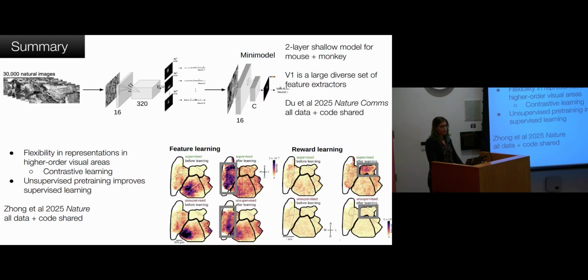Are you zoomed in as well, or no, you're zoomed out? Yeah, so we automatically are, like those stripes you saw, our ROIs are those different stripes. So we process each of those stripes individually. I see. So we have things that are like 400 by 1,000, for example, in the biggest case. And that seems to work okay. But if you're having issues, yeah, you might want to split it even more.